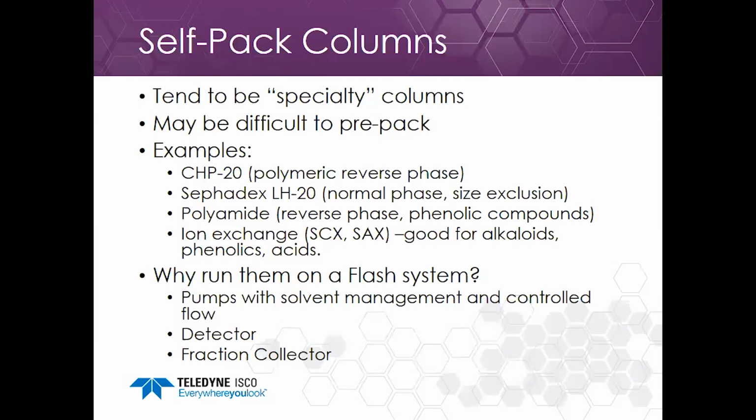Why would you run a self-pack column, essentially a glass column, on a flash system? Well, we have pumps that have solvent management. We can control the flow very accurately, so reproducibility when you run the column the next time becomes a lot easier. We have a detector and a fraction collector built into the system, so you have almost everything you need to run essentially an open glass column with the system.